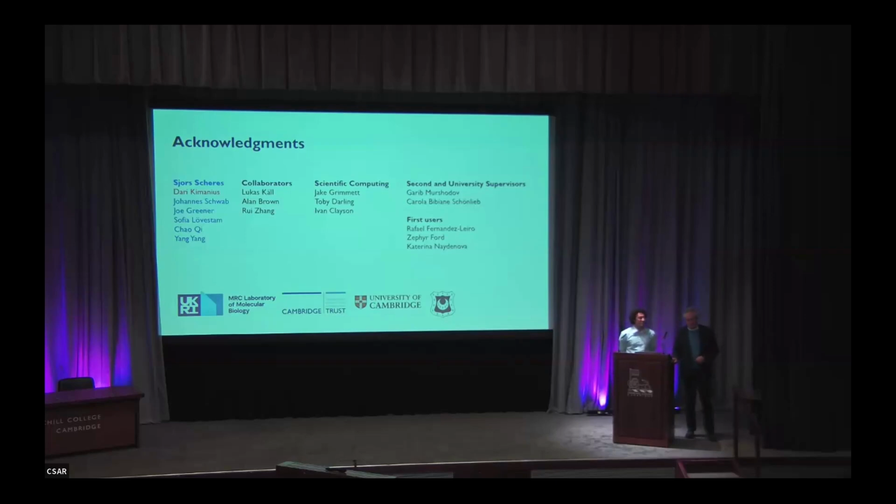Hi, that's really great. What you seem to have shown is a proof of method. You can prove that it works. But what real world problems do you anticipate being able to solve, or have you not got that far yet? No, so it solves quite a few real world problems now. For example, there's a group in, I think, San Diego that do very cool stuff where they have nanobody libraries against a specific target, and they can't easily identify which ones are bound or not.